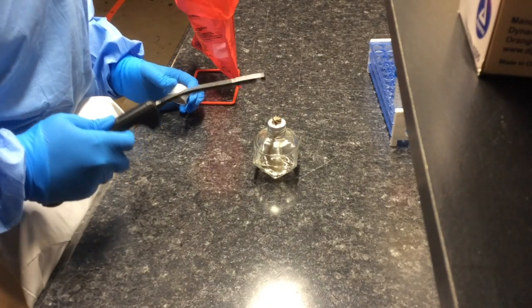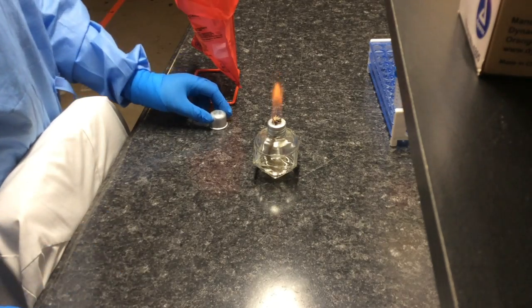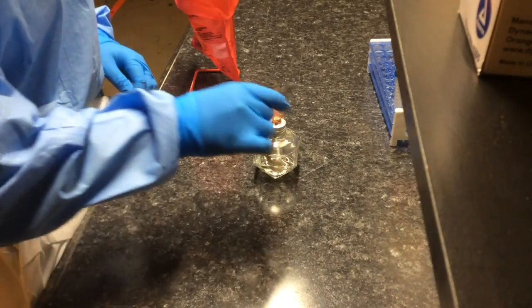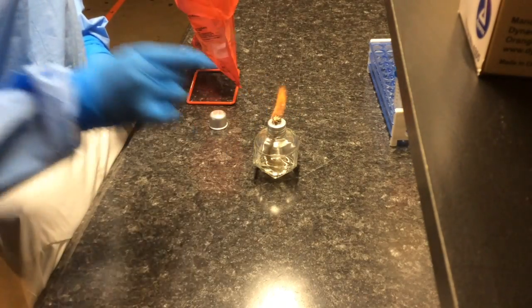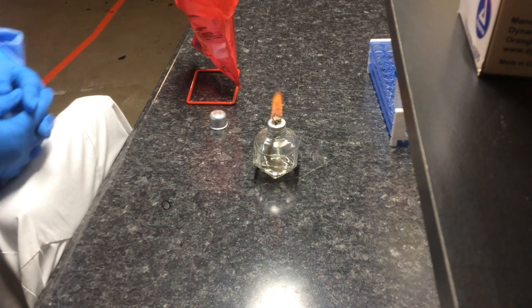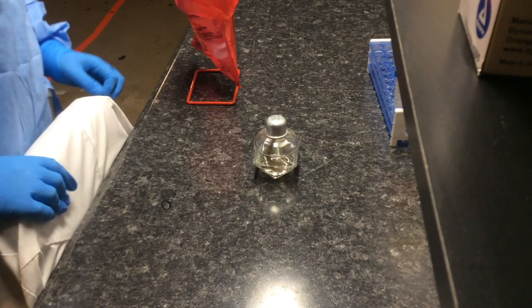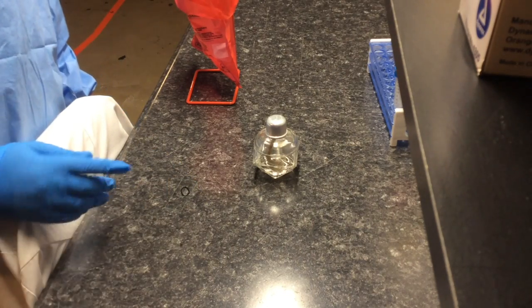Once your slide is dry, light your flame and take your slide — you can see it's now white. Heat fix it by passing it through the flame a couple of times; it doesn't have to be exact but at least two or three times. Once that's done, close your flame and put the slide in a slide holder, and you're done.